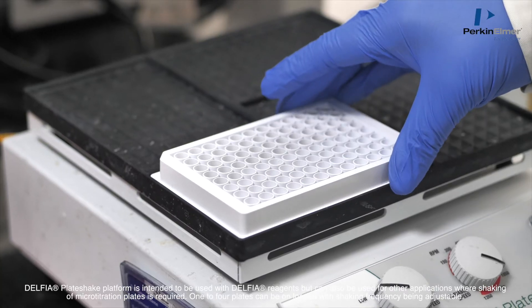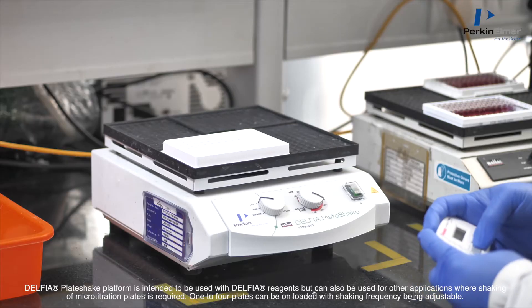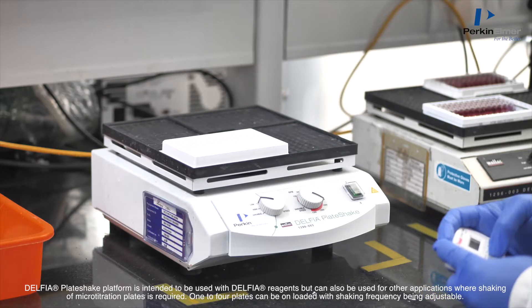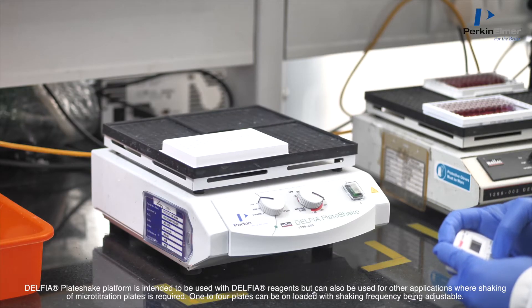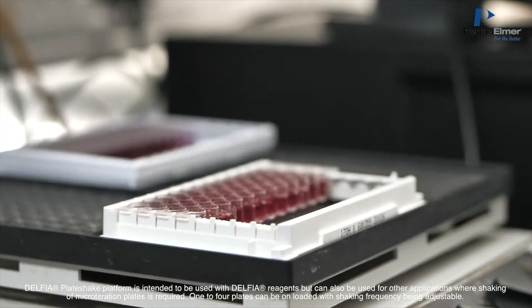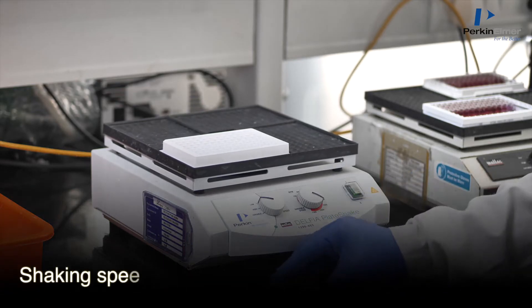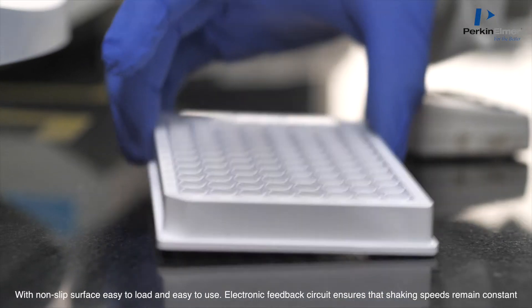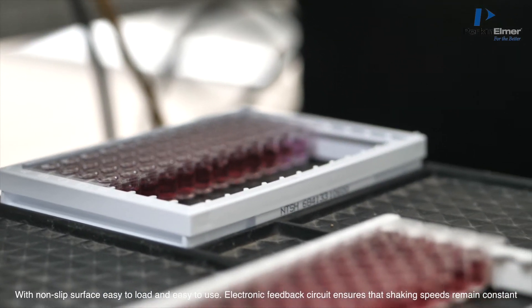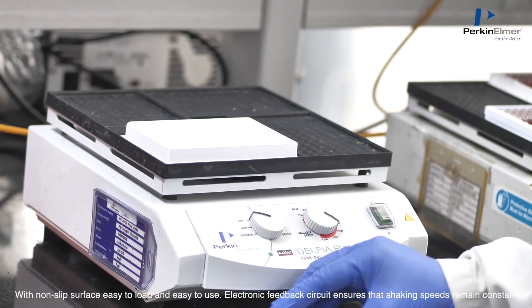The Delphia Plate Shake Platform is intended to be used with Delphia reagents but can also be used for other applications where shaking of micro-titration plates is required. One to four plates can be loaded with shaking frequency being adjustable between 100 to 350 rotations per minute for general use. With a non-slip surface, it is easy to load and easy to use, and an electronic feedback circuit ensures that shaking speeds remain constant.